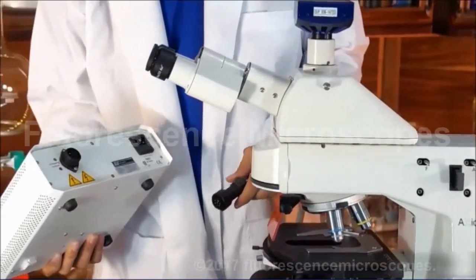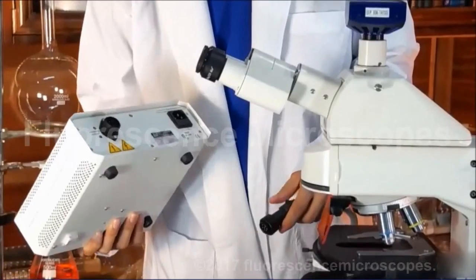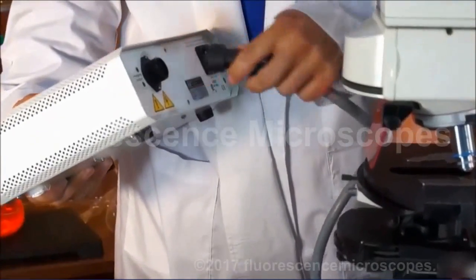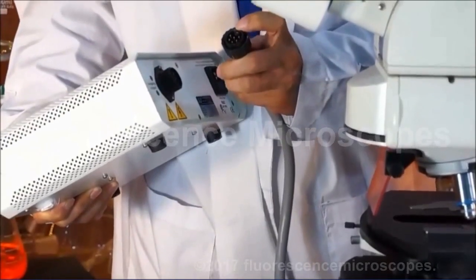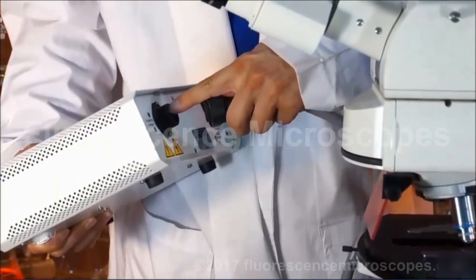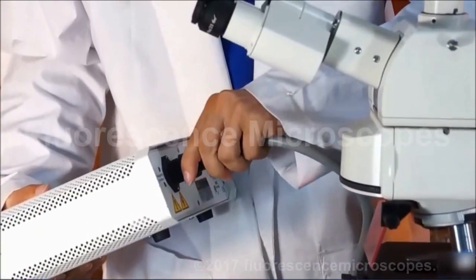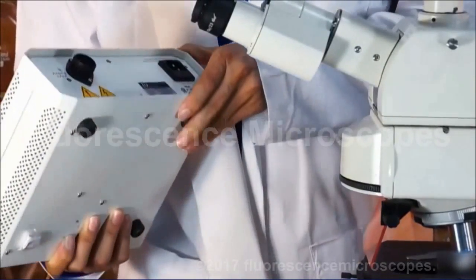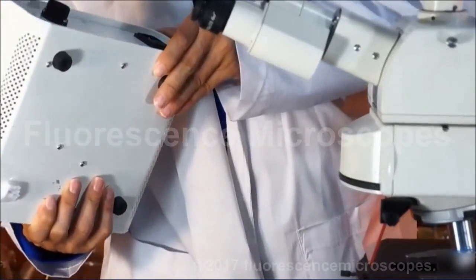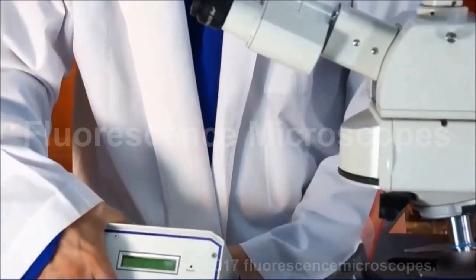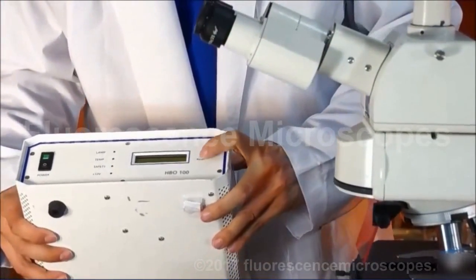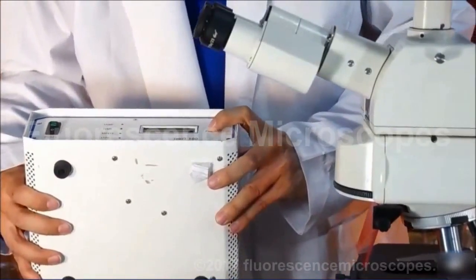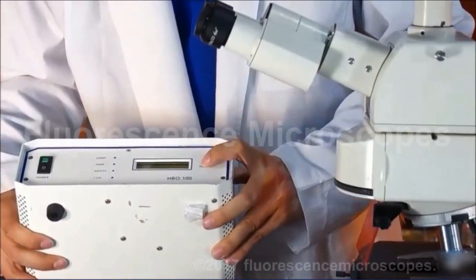So the 100 watt HBO Mercury power supply, simply line up the little notch with the notch here. Push it in and rotate it. This particular one is auto volt. It's got a reset button. You can press a small pin inside to reset it to zero.